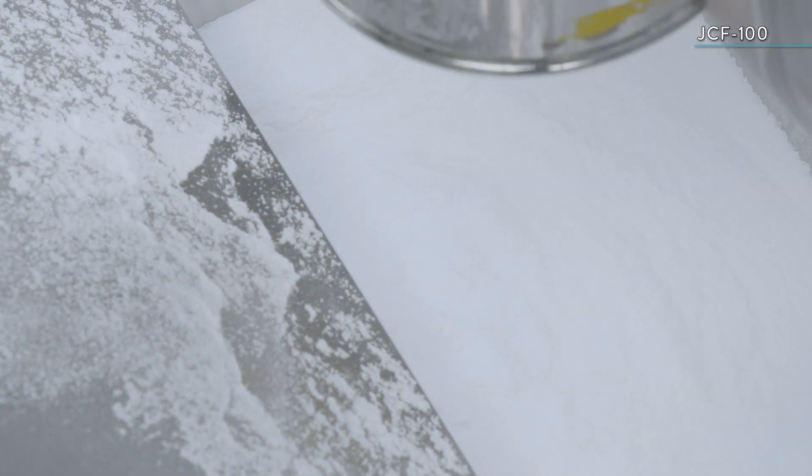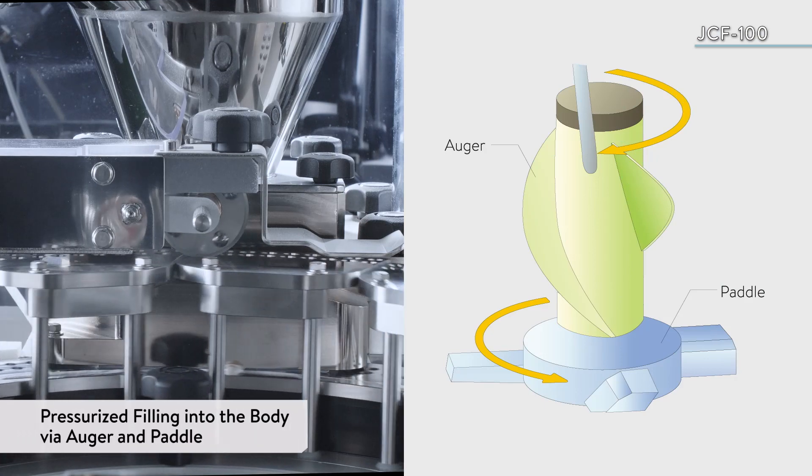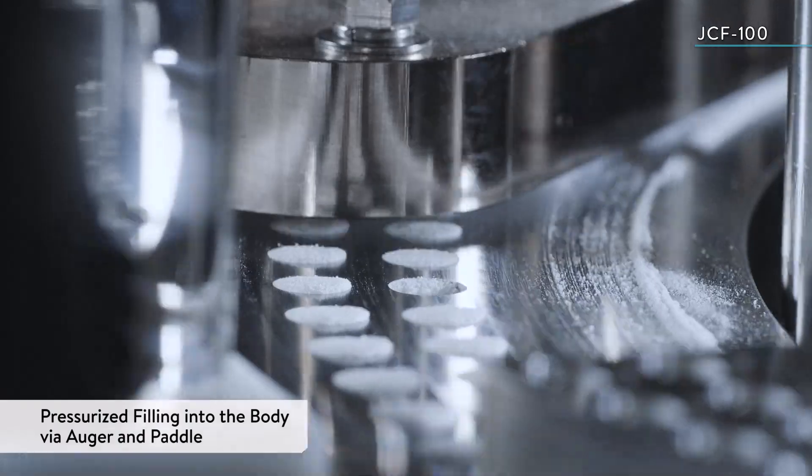Next, the powder supplied from the hopper is pressure-filled into the bodies via auger and paddle.